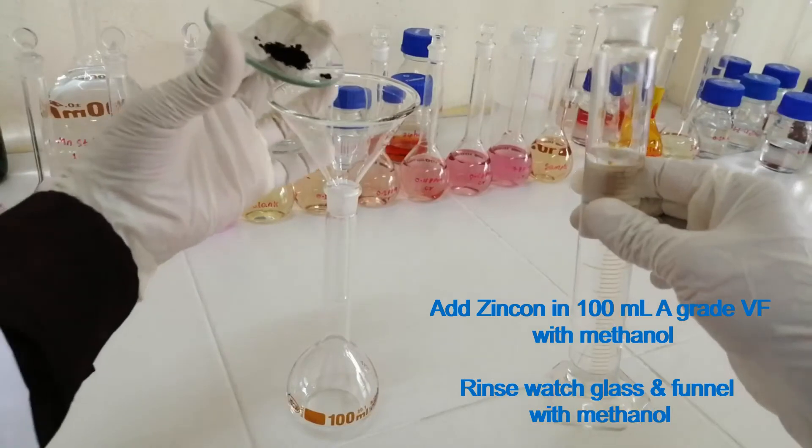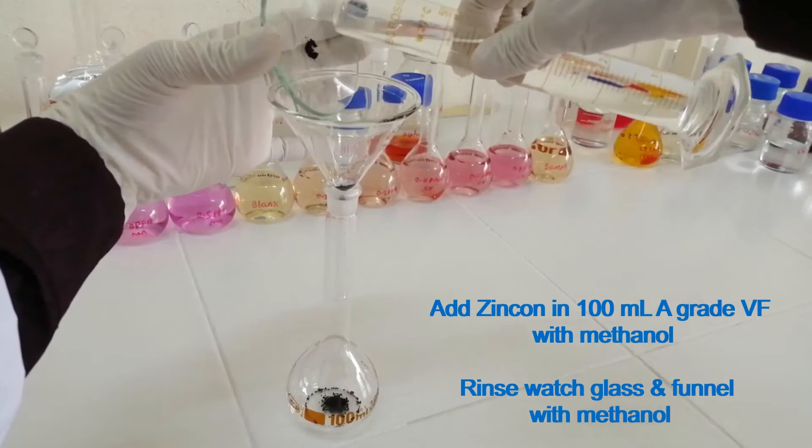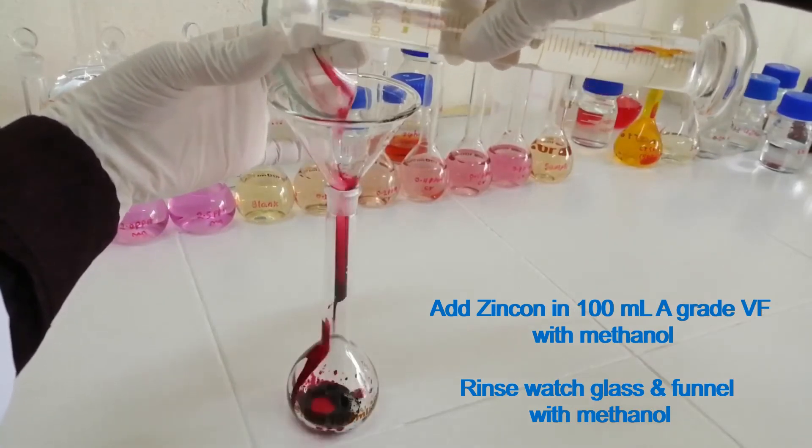Dissolve Zincone in a 100 ml A-grade volumetric flask with methanol. Rinse the watch glass and funnel with methanol.